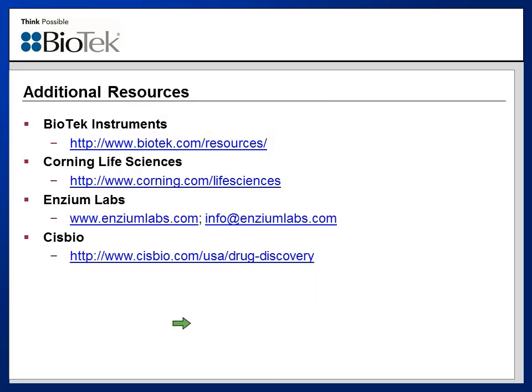So in conclusion, the slides and results that I've shown today hopefully confirm how proper instrumentation, microplates, cell models, assay chemistries, and testing procedures can provide combined processes that are both easy to perform and provide accurate, reproducible data to better understand the target-based and phenotypic effects of potential inhibitors of tumor invasion and metastasis.